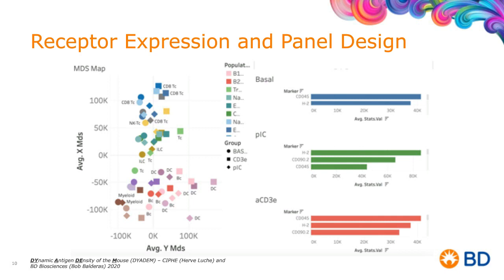Those specificities that are listed in this deep database will allow you then to take that information and build it into a rational design for your panels. Hervé and I are working on this for publication. We certainly have a sense of urgency to get this out, and it was nice to see the new data that Hervé just sent over just last week to actually place in here.